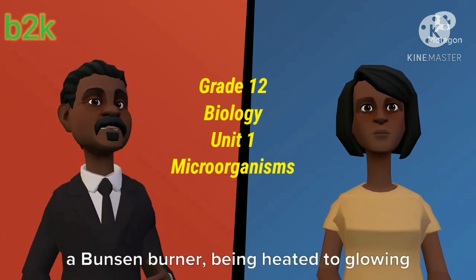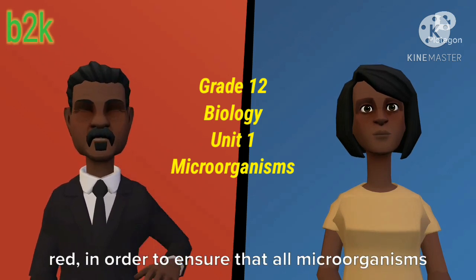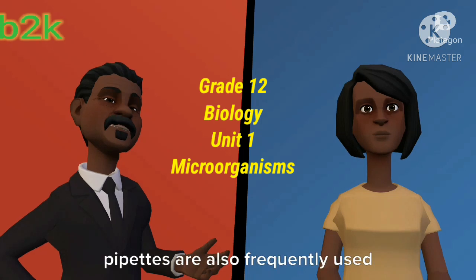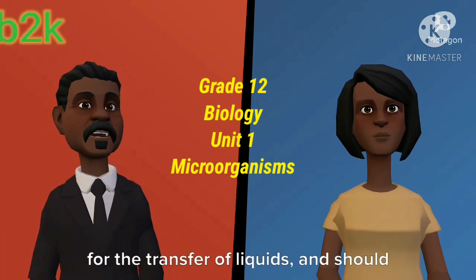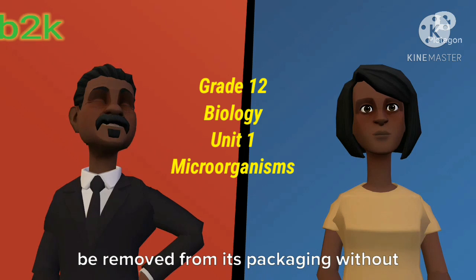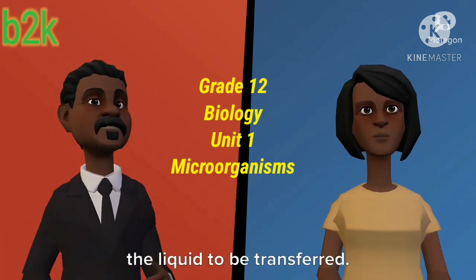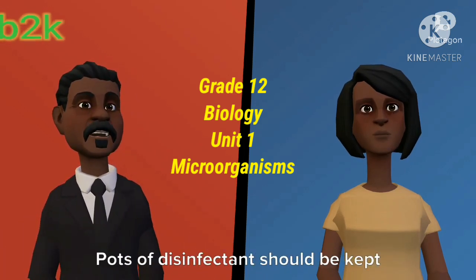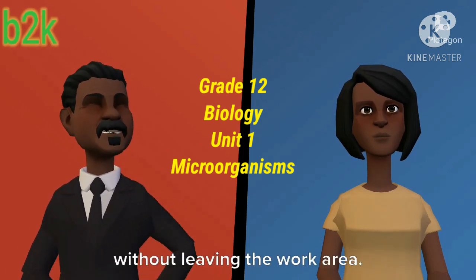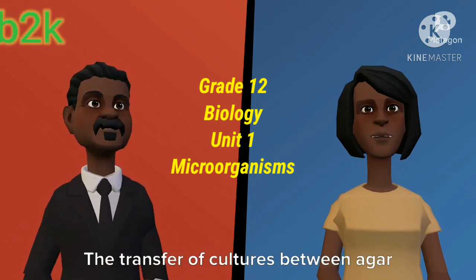Wire loops are sterilized by flaming over a Bunsen burner, being heated to glowing red in order to ensure that all microorganisms present on the loop are destroyed. Disposable pipettes are also frequently used for the transfer of liquids and should be removed from packaging without touching the tip to any surface besides the liquid to be transferred. Pots of disinfectant should be kept close by to dispose of such items without leaving the work area.